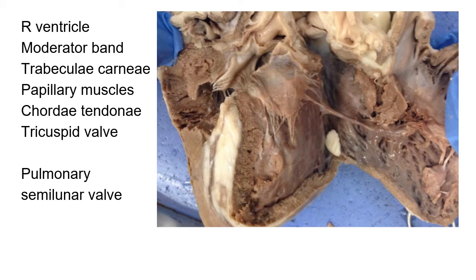Okay, imagine we've now performed one of the incisions for our dissection and we have sliced through the right ventricle. The slice you see here, that's the wall of the right ventricle. So we cut through it and we opened it up like a door and we're staring straight inside of it. Now again, how do I know this is the right ventricle? Well, I have two landmarks.